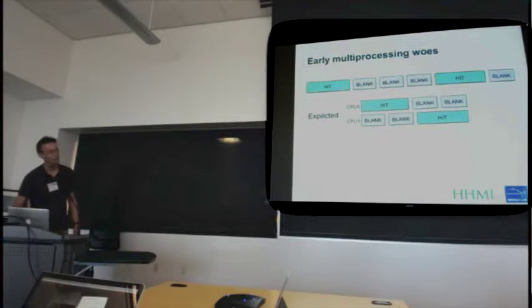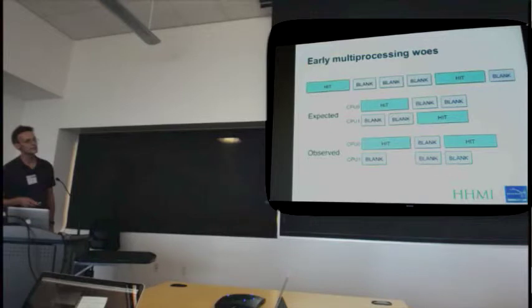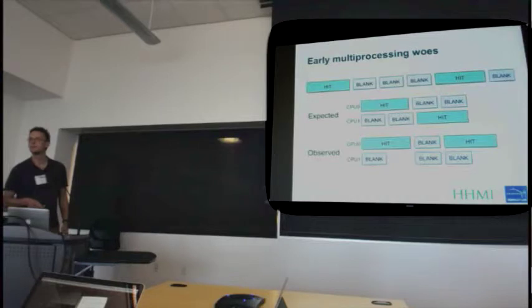And it turned out, and this was really figured out by David Skinner at NERSC and Andrei Salnikov at SLAC, that this was not happening. What happened is that it would round robin these events to the different processors. So what you're noticing here is the first image, the second, and the third, fourth, fifth, sixth, and we have this idle time. It doesn't look so dramatic if we're just considering 6 events, 2 of which are hits, but on large real data sets, this was really degrading multiprocessing. The difficult part about this problem was getting to the stage where we could identify what was going wrong, and then it could be fixed very quickly.